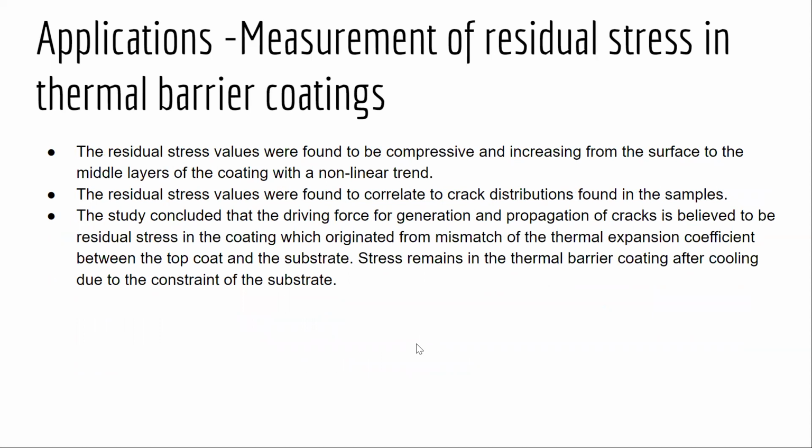The residual stress values were found to be compressive and increasing from the surface to the middle layers of the coating with a non-linear trend. Residual stress values were found to correlate to crack distributions found in the samples. So they found good correlation with their test results.